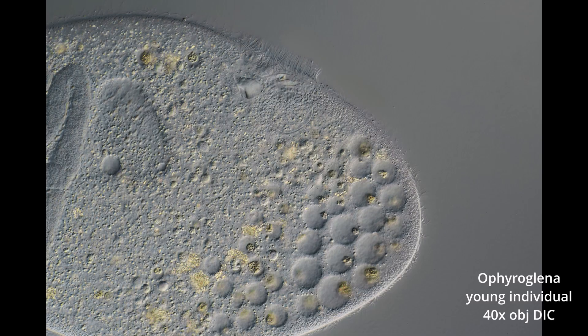So now we move to the 40-power objective. You can see a bit of the macronucleus on the left side, which is just coming into the frame. Looks like there's food vacuoles on the right side. The mouth part is upper, just right of center. And it looks like you can see that little light sensor bridge in there towards the edge of the body.